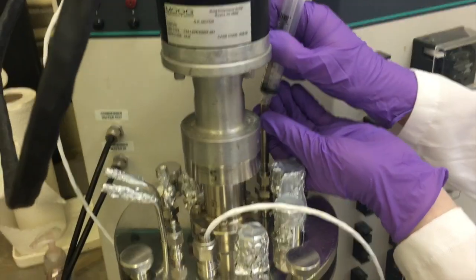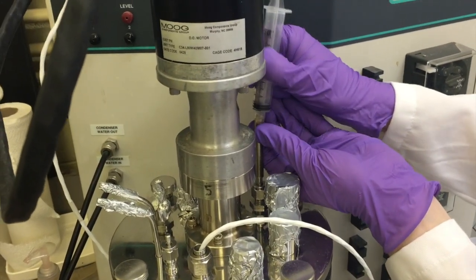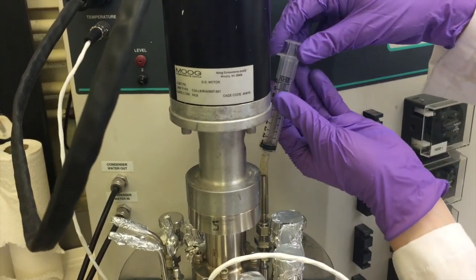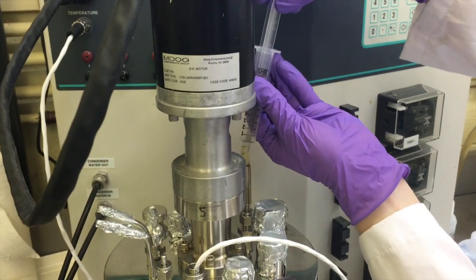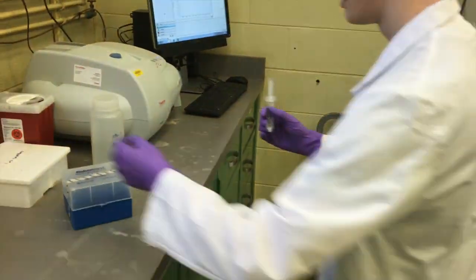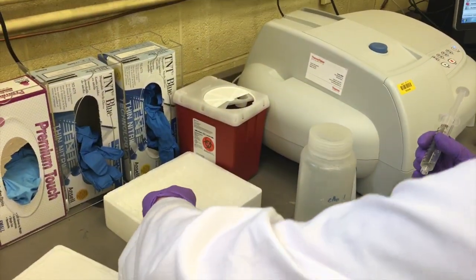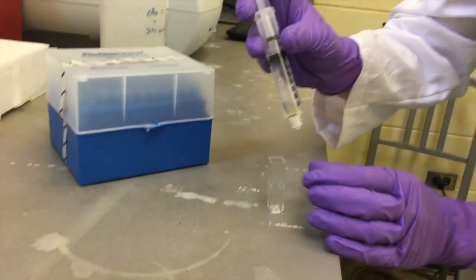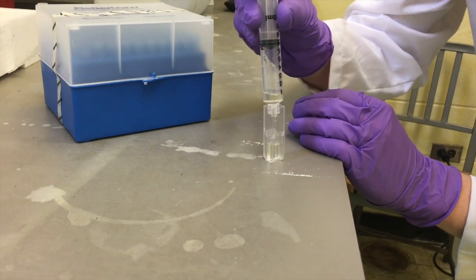At the start of the reaction and every 30 minutes after, use a syringe to withdraw sample from the reactor. Transfer the sample to a cuvette and measure the absorbance using a spectrophotometer previously zeroed with media as shown in the benchtop procedure. Repeat until consecutive data points are identical or until the reaction has run for 8 hours.